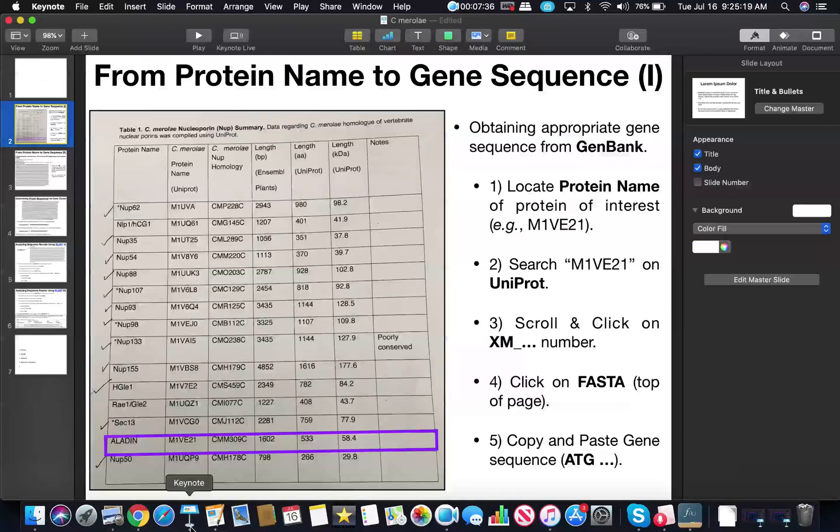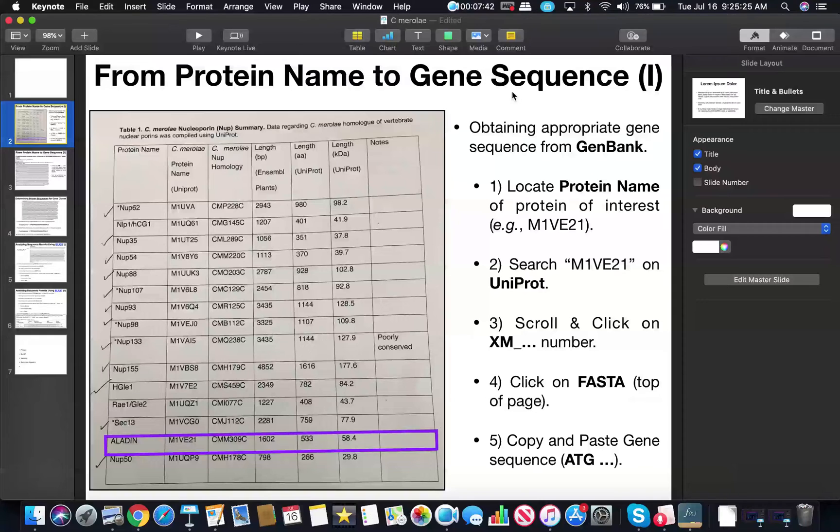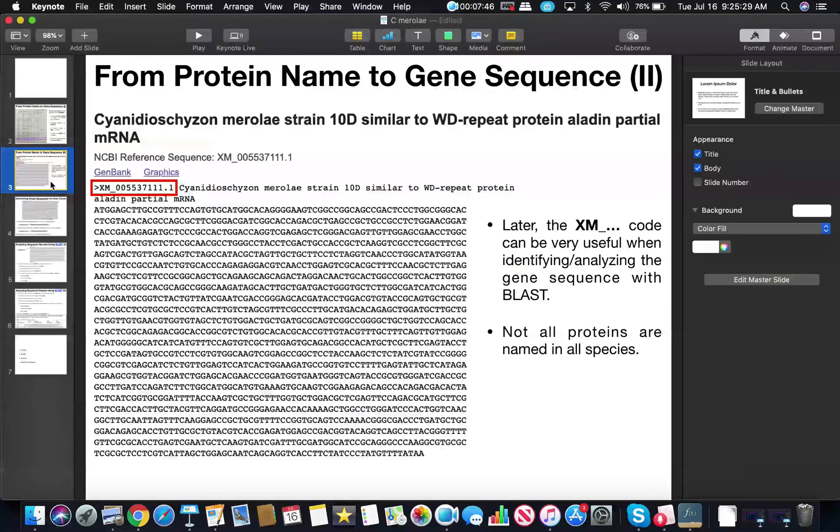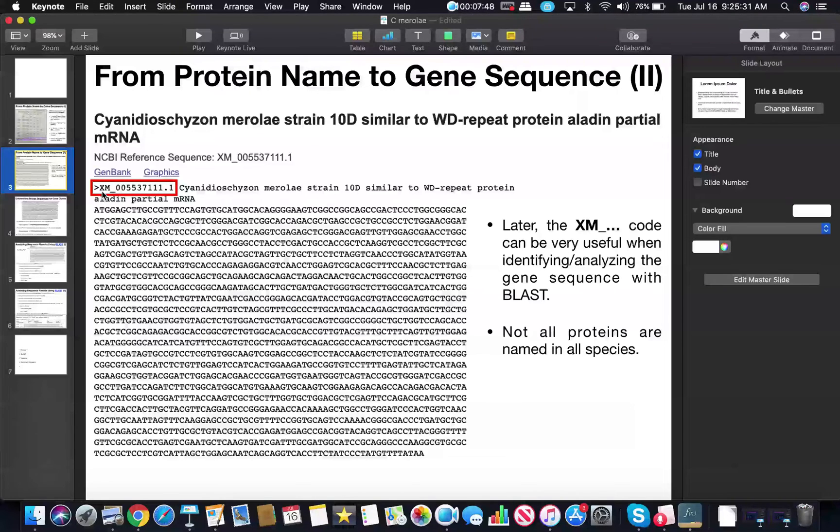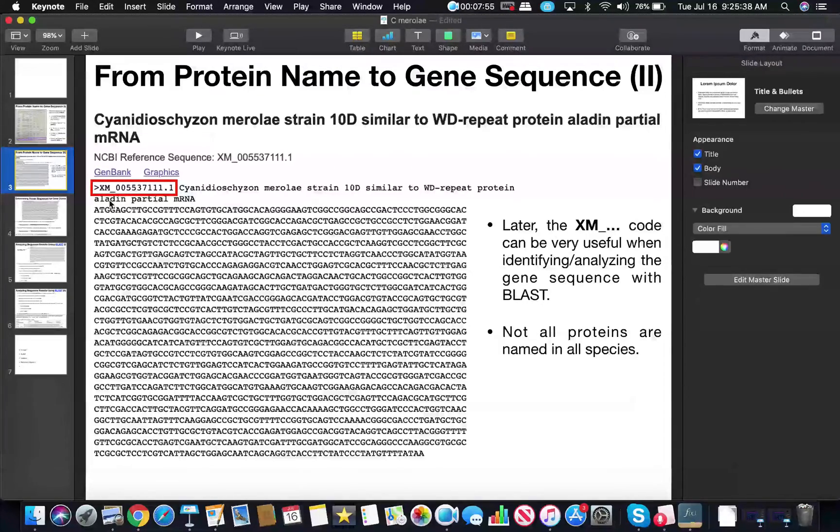If we go back to one of the slides that we looked at in the previous videos, when we actually determined the sequence we wanted, we used UniProt and we actually got this XM number: XM underscore 005537111.1. This is going to be the sequence encoding the Aladdin protein, at least the mRNA.